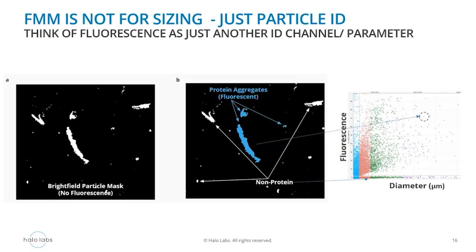And I agree with you, the images are mesmerizing and very satisfying to look at. However, the data goes beyond just the pretty images. Here we have some more sample-specific data after successfully staining with the appropriate dye or fluorophore.